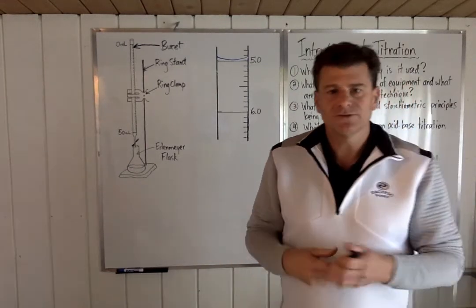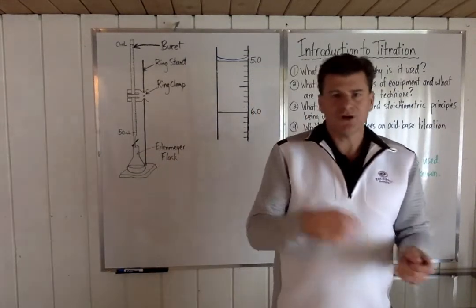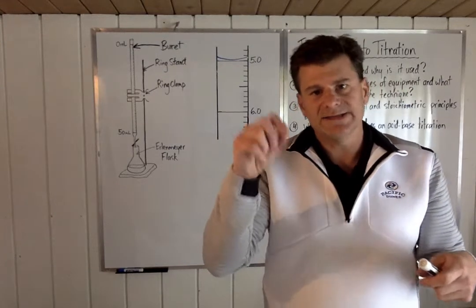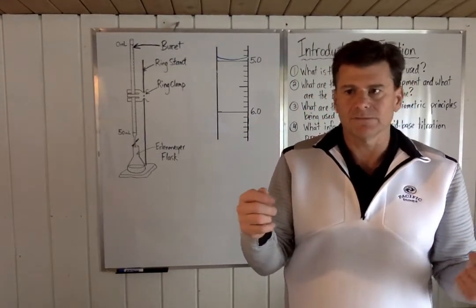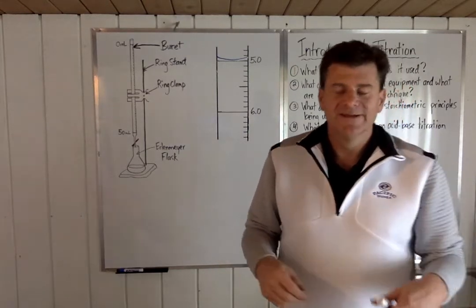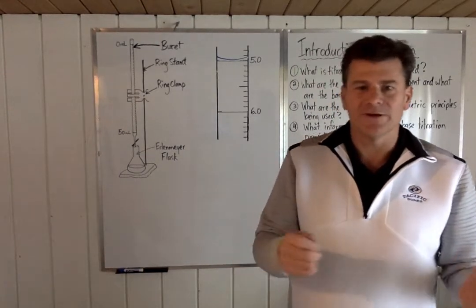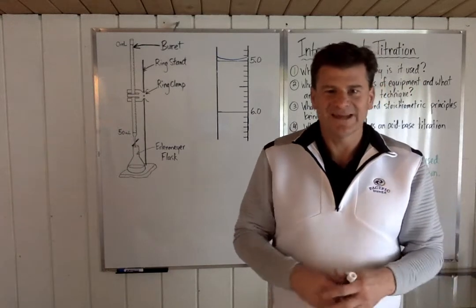One thing that I try and make sure that my students do, technique-wise, is that with the Erlenmeyer flask, you always try and have the tip of the spout of the burette down below the rim of the Erlenmeyer flask, just so that you don't accidentally pour some if you happen to miss. Sometimes if you're not paying attention, you can move the Erlenmeyer and then you miss the thing. And anyways, that's a whole other can of worms.